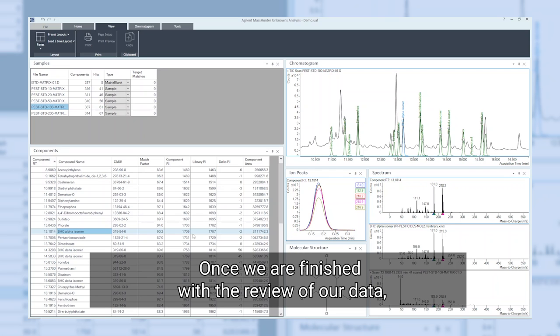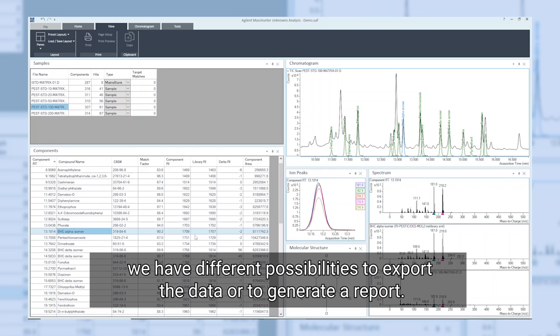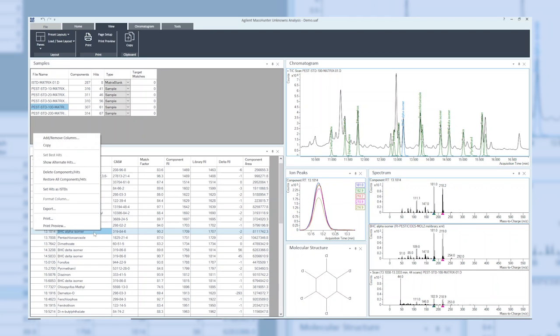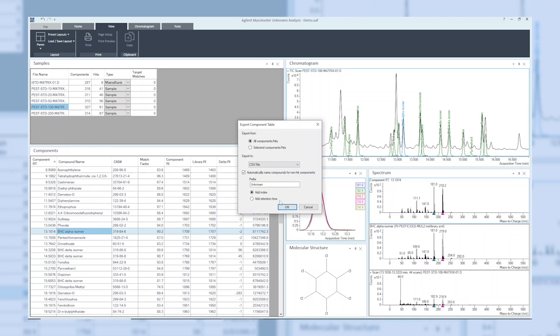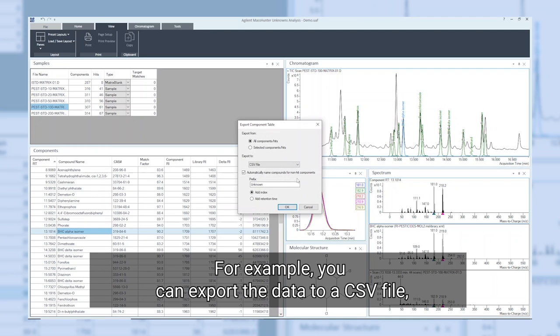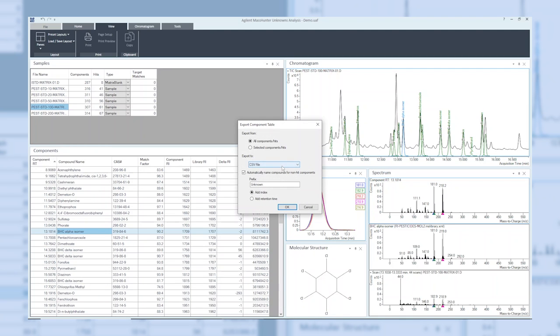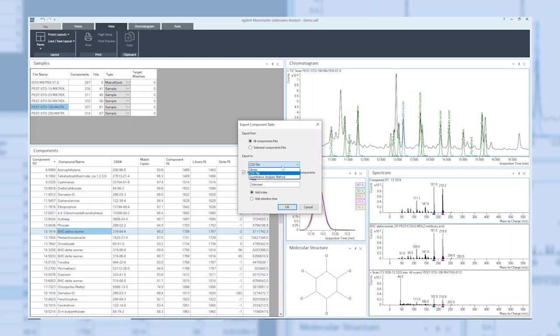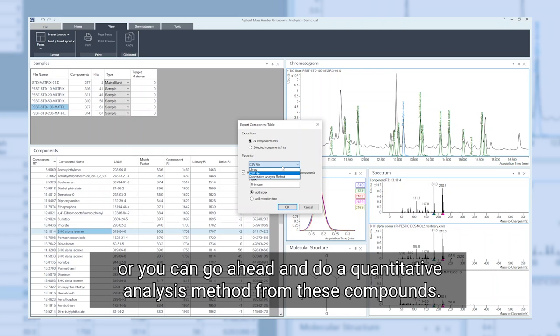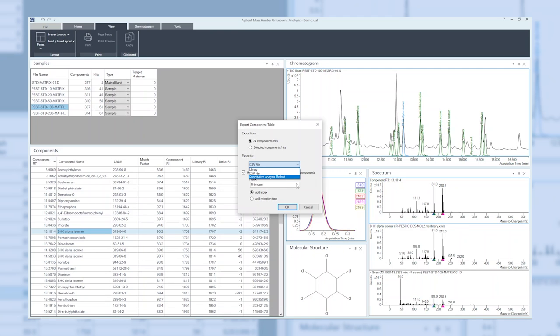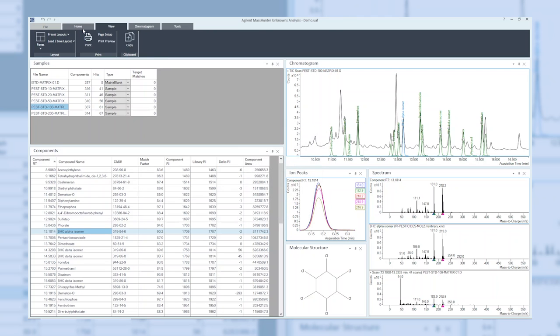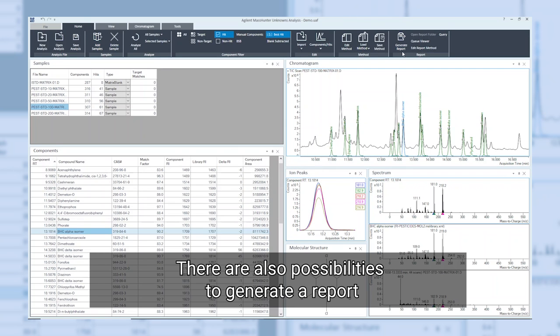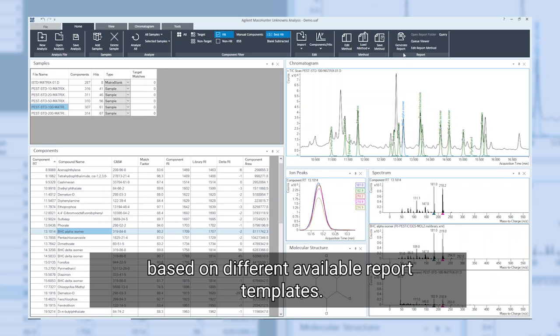Once we are finished with the review of our data, we have different possibilities to export the data or to generate a report. For example, you can export the data to a CSV file, directly to a library, or you can go ahead and create a quantitative analysis method from these compounds. There are also possibilities to generate a report based on different available report templates.